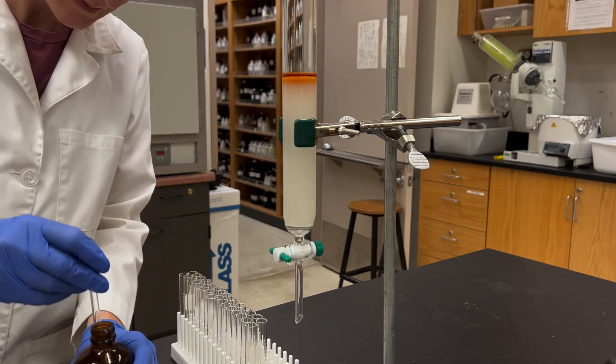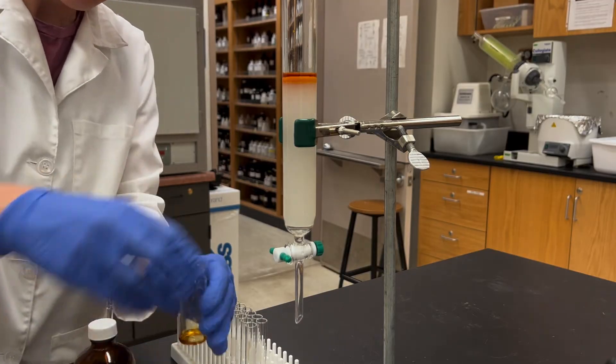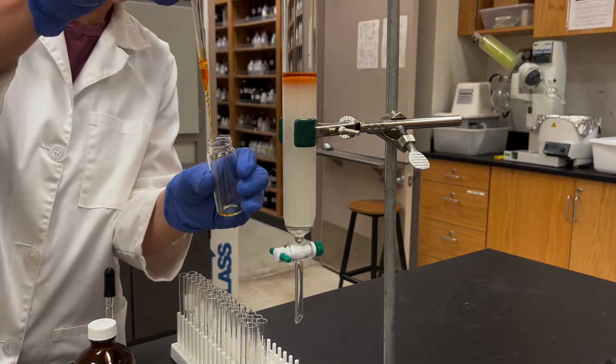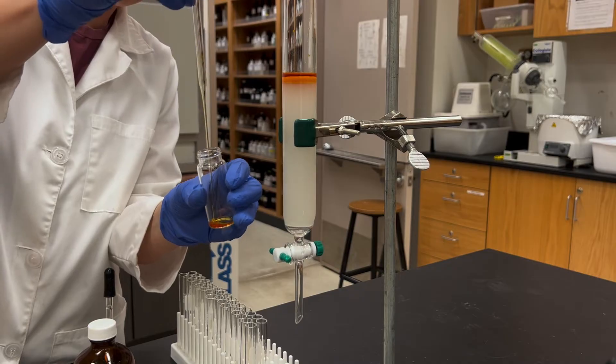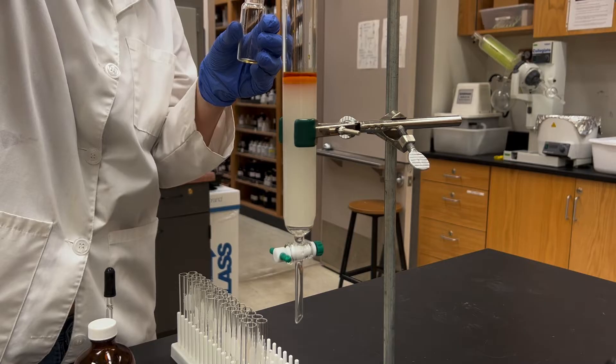After I've added my sample, I noticed that my vial still has quite a bit of residue in it so I'm going to do a rinse. I add a small amount more of dichloromethane and then use a pipette to add that rinse to the column as well.